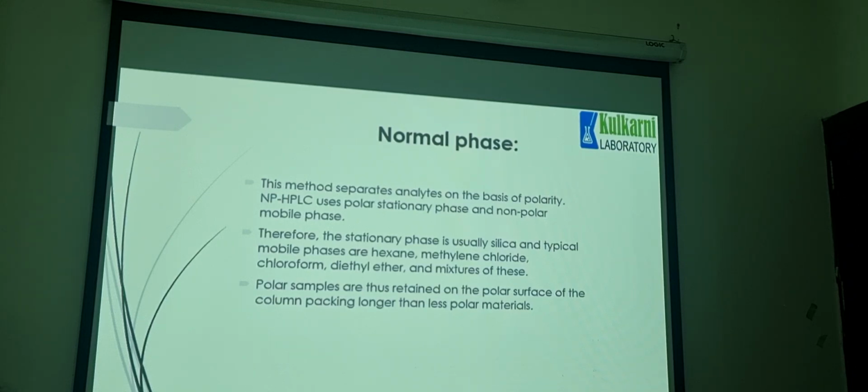Because your stationary phase is polar, whatever polar components are there will be stuck on that stationary phase. So their retention time, or their elution time, will be longer than the non-polar solutes. Understood? Yes. So this is the normal phase chromatography.